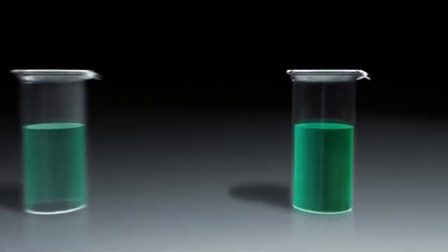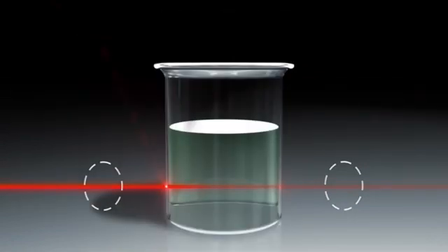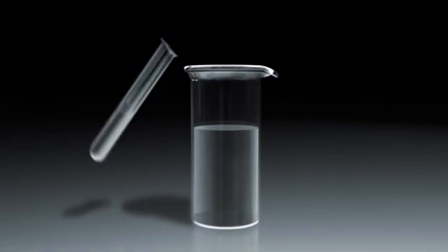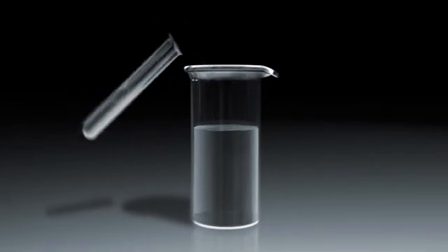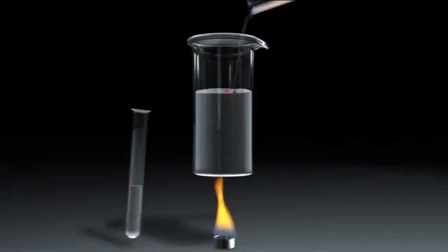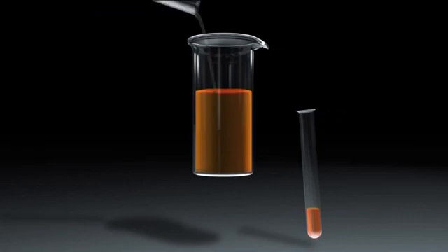If the concentration of the solution is greater, more light will be absorbed, which can be identified by measuring the difference between the amount of light at its origin and after passing through the solution. In order to determine the concentration of an unknown sample, several sample solutions of known concentration are first prepared and tested. The concentrations are then plotted on a graph against absorbance, thereby generating a calibration curve. The results of the unknown sample are compared to those of the known samples on the curve to measure the concentration.